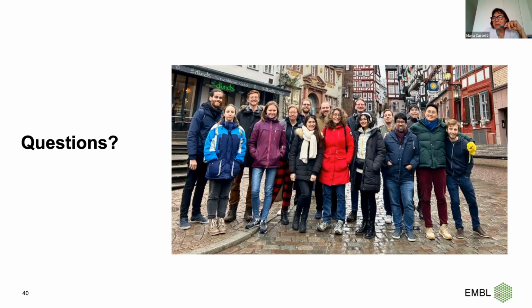What do you recommend for Ilastik when you are trying to, for example, identify double labeling immunohistochemistry at the nuclear and cytoplasm of the same cell? There are many tasks where it would be interesting to know how you suggest to work.